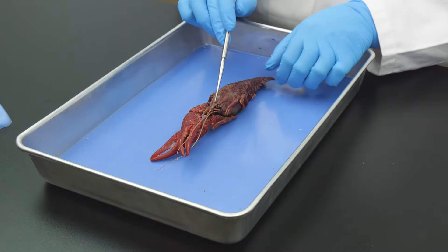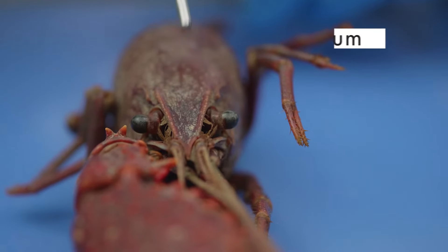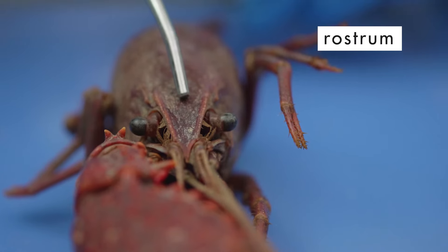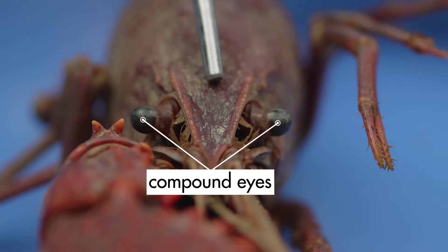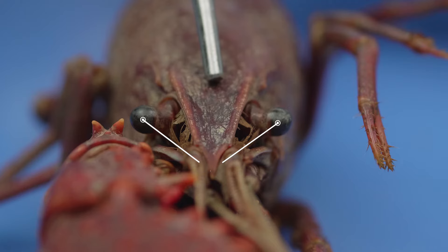The triangular-shaped part of the carapace between the eyes is the rostrum. The crayfish has two compound eyes, which extend above the body on eyestalks.